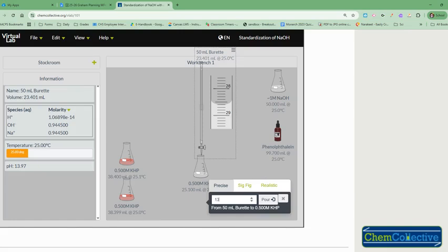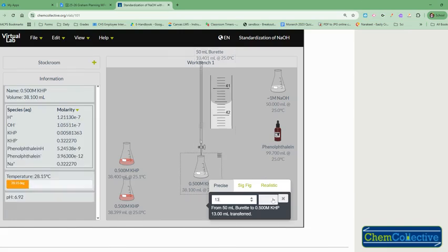I'm going to add 13 milliliters very quickly because that did not change color. Now I'm going to do 0.1, but I'm only going to do it twice: 1, 2. If you're watching really carefully, I think I saw it change. So now I'm going to switch to 0.01 to see if we can get it more accurate. I'm adding just a little bit at a time, and I'm seeing a color change.